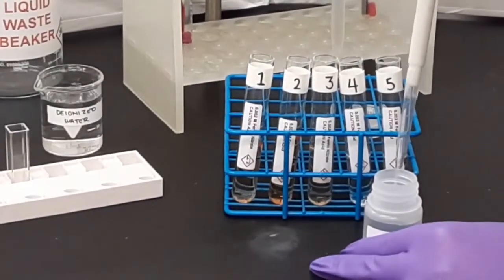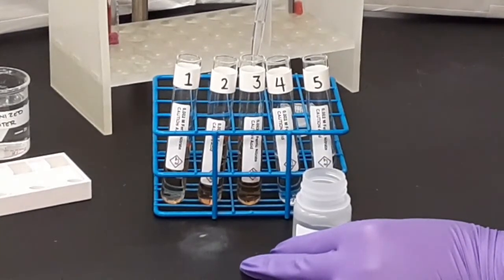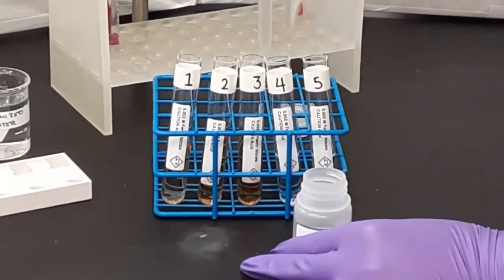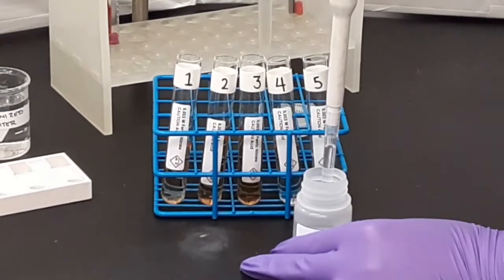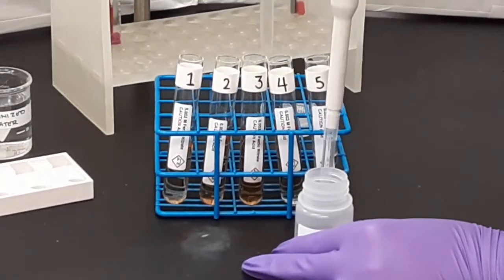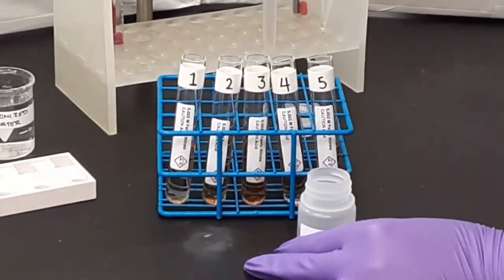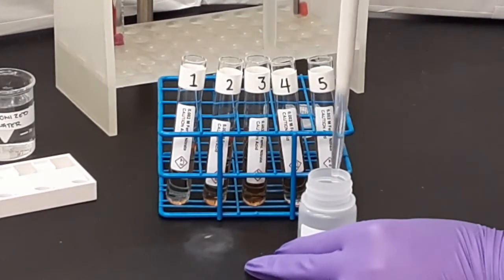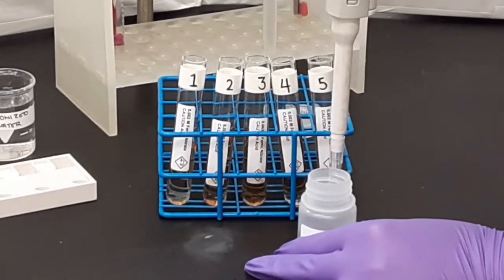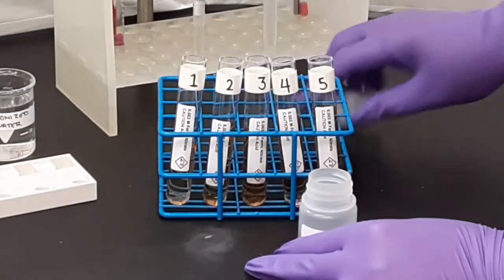Number 3. We'll zoom in here a bit. Now remember, if you choose to use either of the pipettes for all of your work, flush the tip before you change from reagent to water. Okay, now she's added all of her reagent. Next, the water.